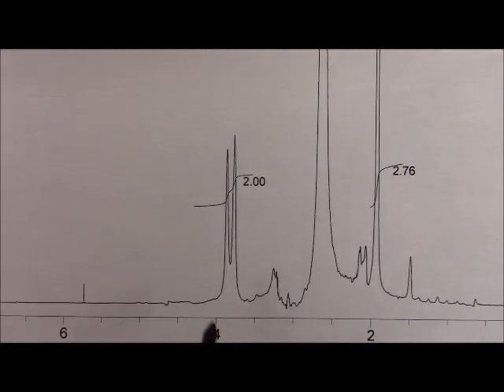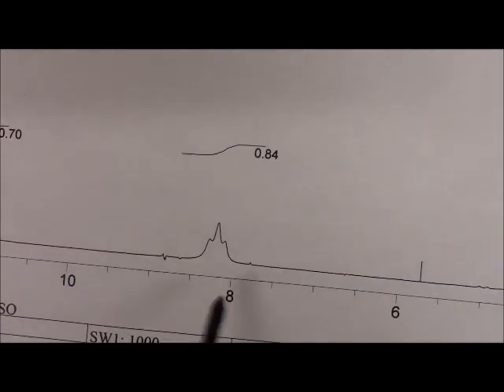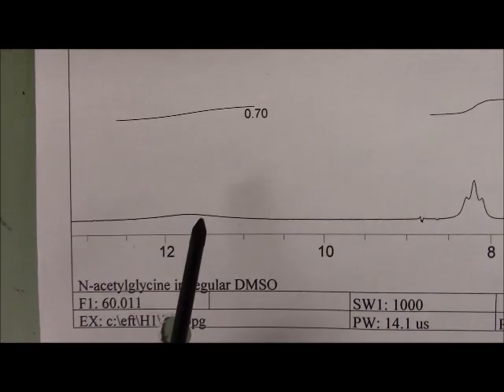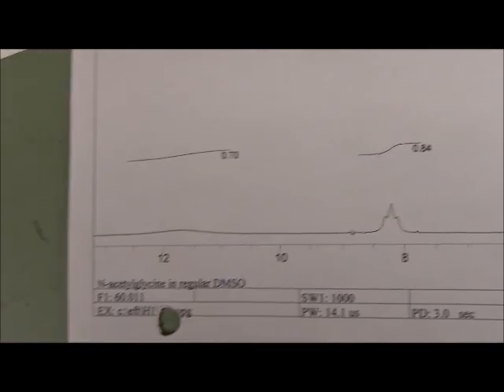So the point is, you're going to see a singlet worth 3 at 1.96, a doublet at almost 4, worth 2, and a little ugly looking triplet around 8-ish. Those are the 3 peaks, A, B, C. The peak D, most of you won't see way out at 12. It's just like a flat line.